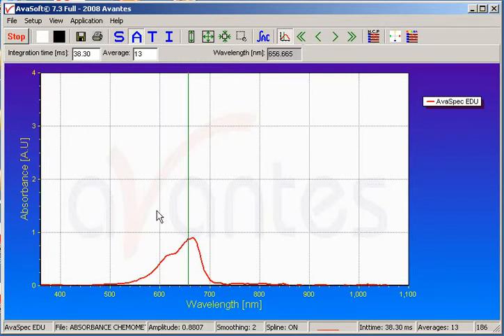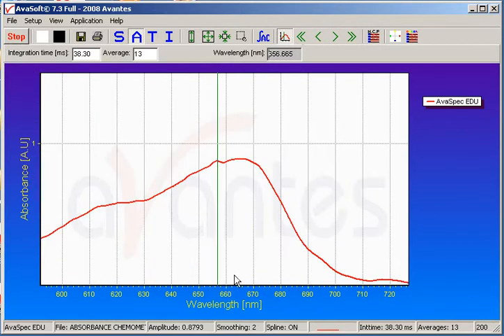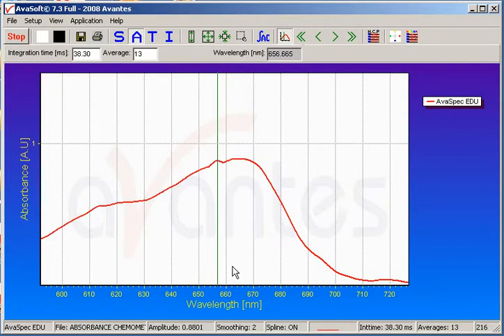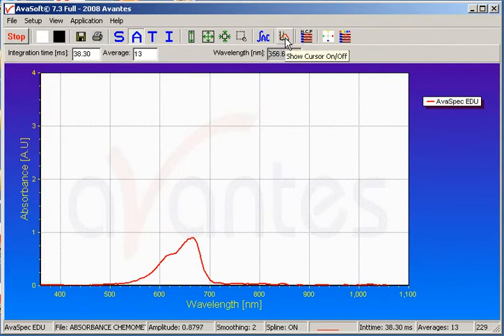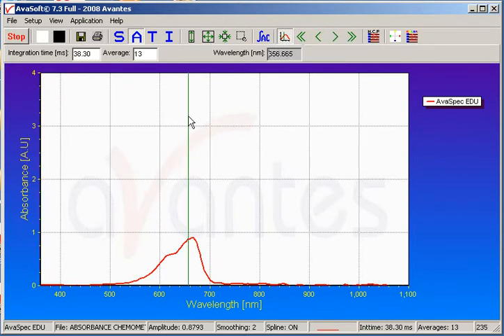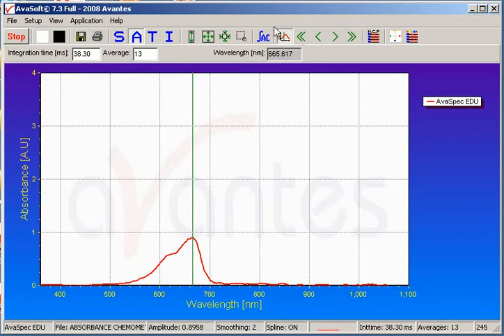We can determine the center wavelength one of two ways. We can zoom in by using a left mouse click and dragging from upper left to lower right to see more granularity on the x-axis, determining that about 665 nanometers is the maximum for this peak. To zoom out, simply drag from lower right to upper left. Alternatively, we can use the peak finder function — clicking it makes a green line appear — which confirms that around 665 nanometers is the center line, displayed in the window box.